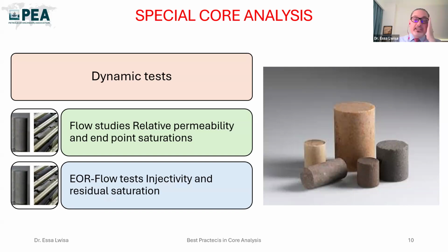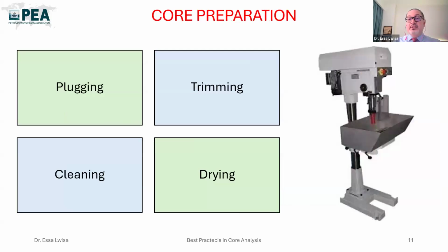I will start talking in more detail about the routine core analysis right now, and first things first is core preparation. In core preparation, there are 4 steps. The first one is plugging. The second one is trimming. Third one is cleaning. Fourth one is drying.